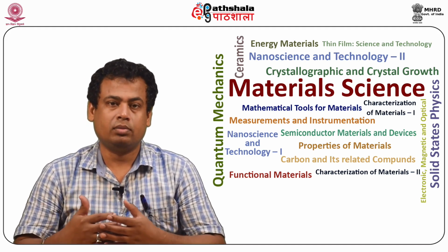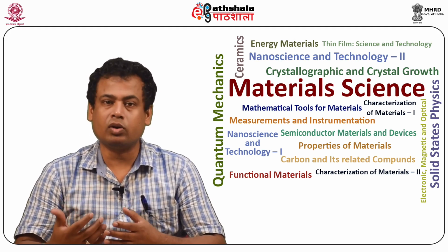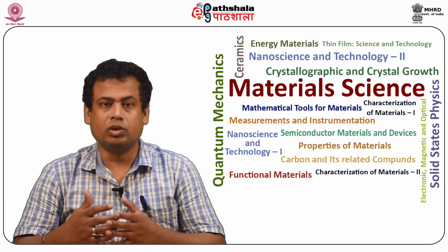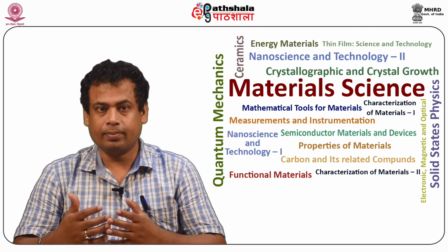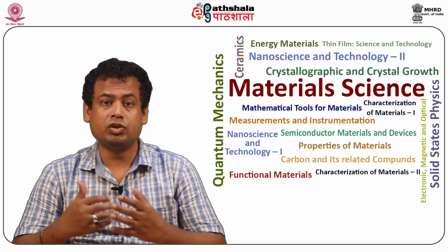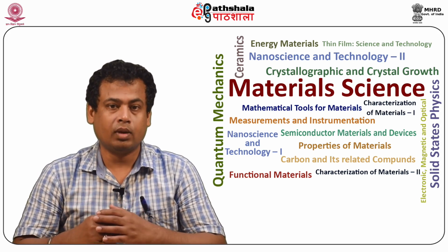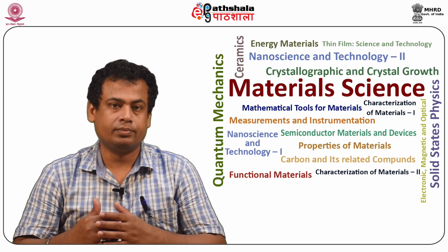Field emission does not make use of heat to excite the electrons from the filament. Field emission guns are cold electron sources because the electrons are not released from a heated filament as in the conventional thermal emission gun, and the electrons are pulled out by the field.